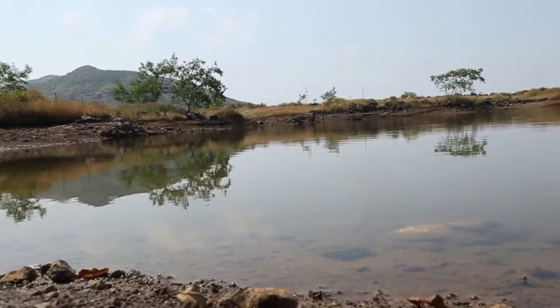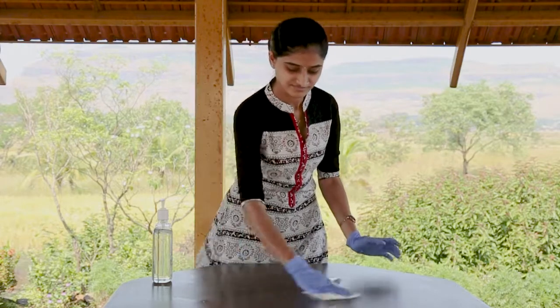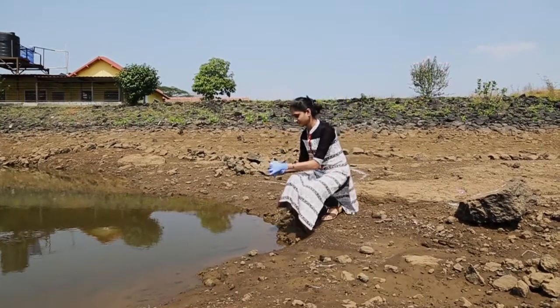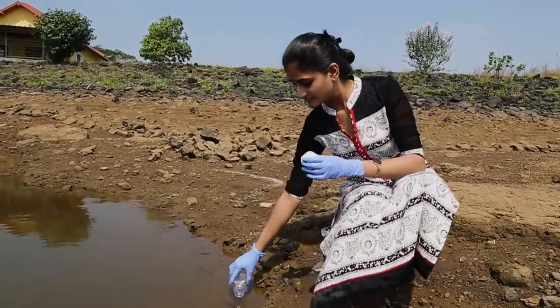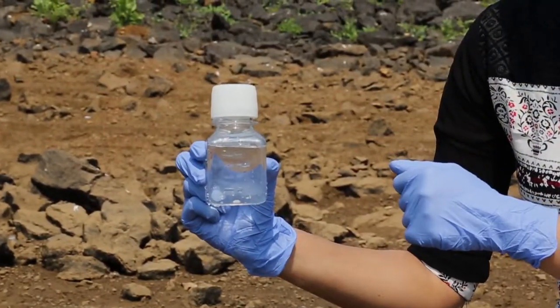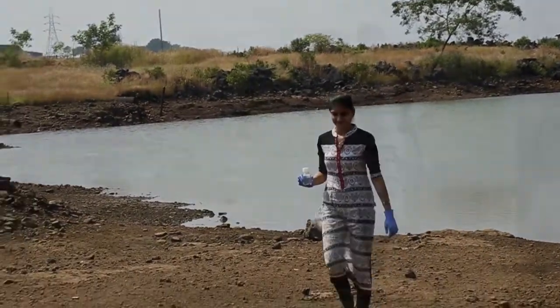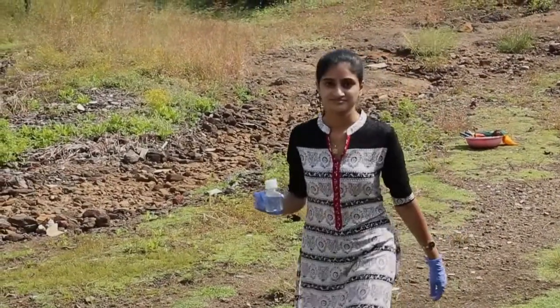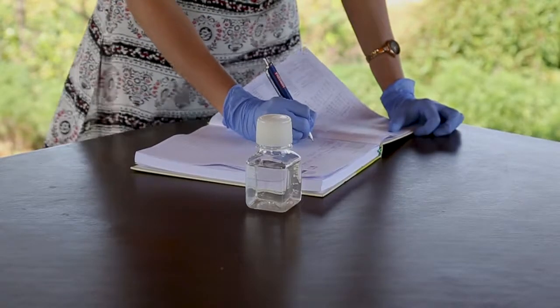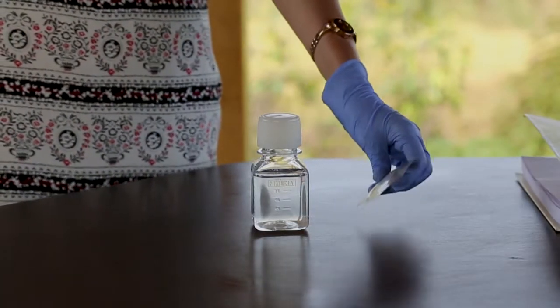To use the HET, first prepare and sanitize your space for testing. Then collect your 100-milliliter water sample from the source you need to test. Record details of your sample. Avoid touching the inside of the sample container and lid. Remember that you must begin the testing process within six hours of sample collection.